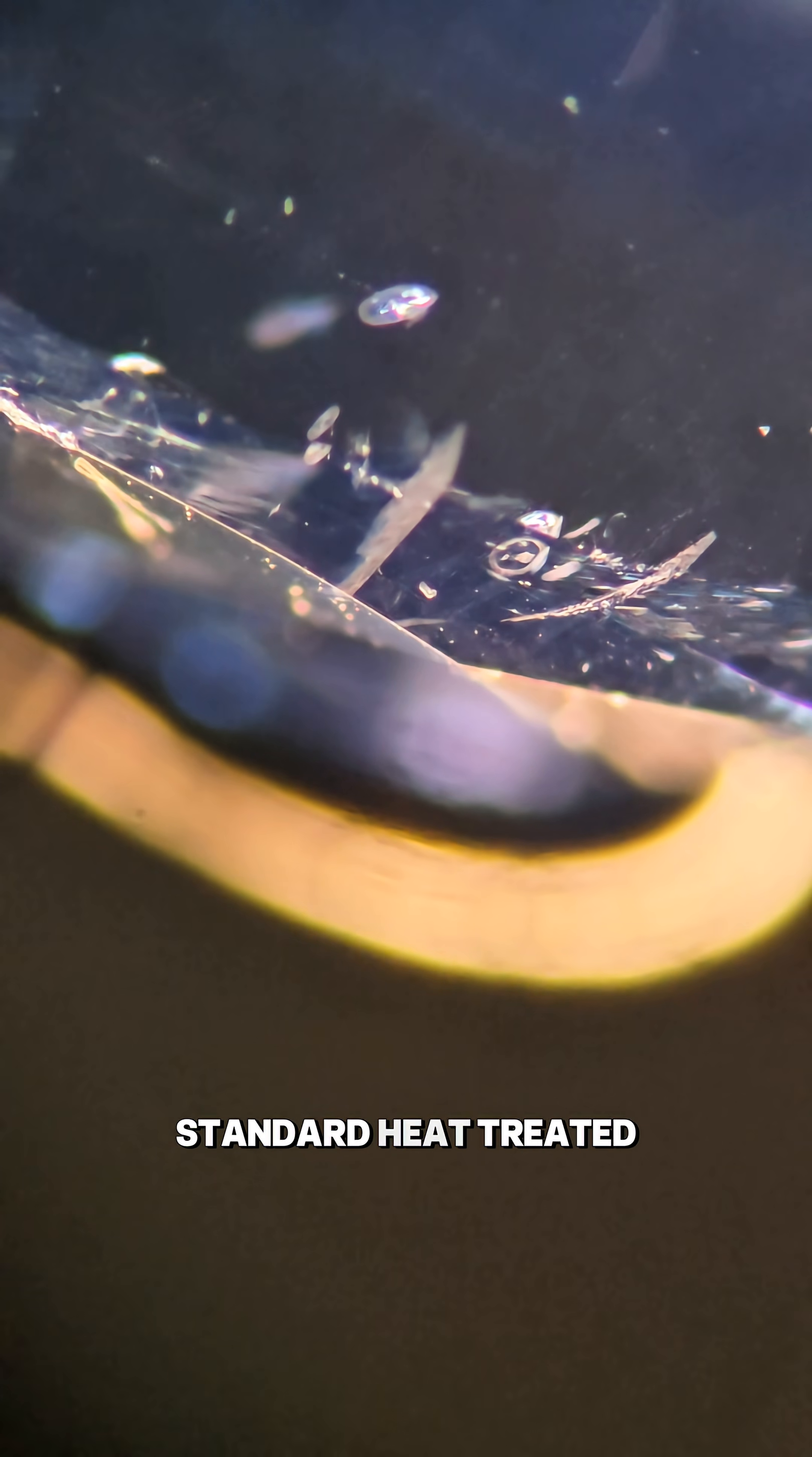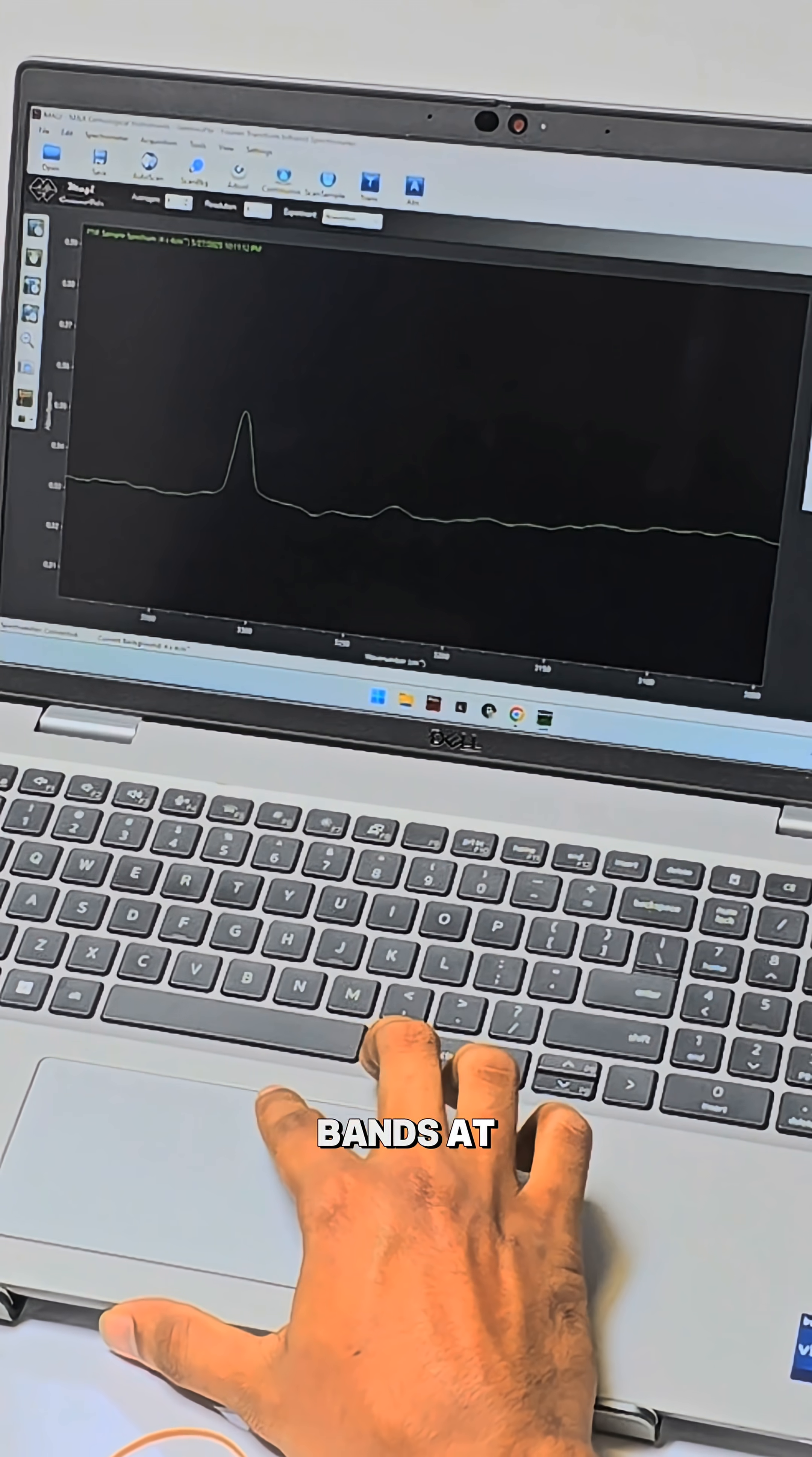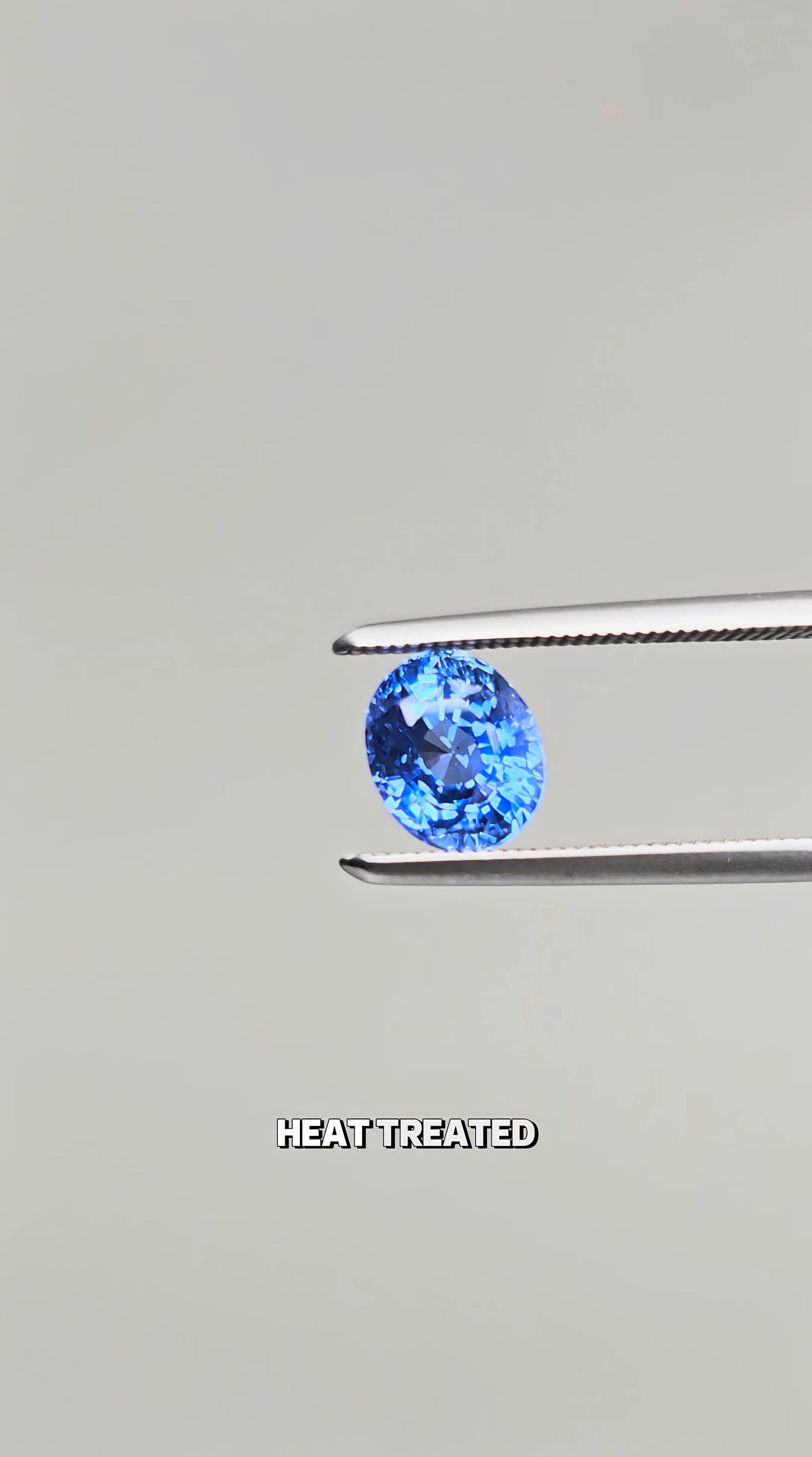To further confirm, I'm taking it to the FTIR spectroscopy. I'm seeing absorption bands at 3309, 3232, and 3185 wave numbers. This series strongly indicates heat treatment. Natural blue sapphire: heat treated.